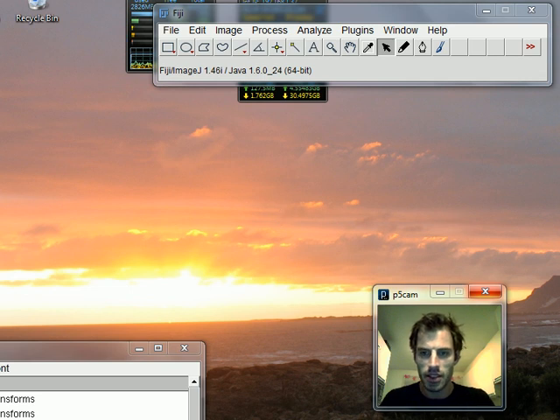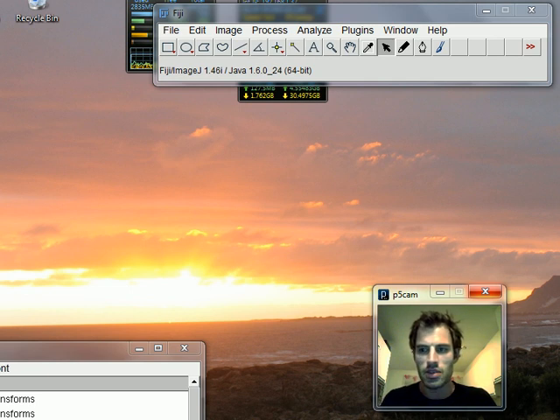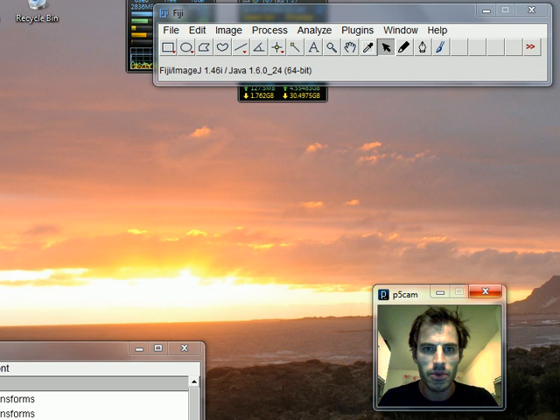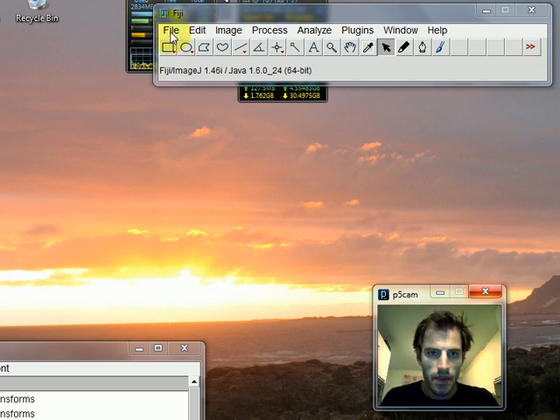In this screencast I'm going to show you how to register a stack of 2D images onto each other using Fiji, which is a derivative or distribution of the ImageJ image processing tool. There are many ways to do this; this is one of them.